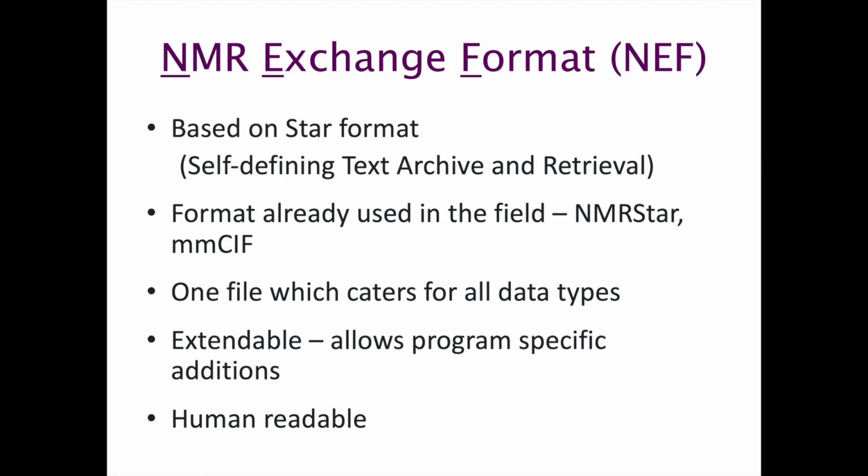So the NMR exchange format is based on the STAR format, the so-called self-defining text archive and retrieval format. You're very possibly already familiar with it from NMR-STAR files, and mmCIF files also use the STAR format. The nice thing is that within one single file you can cater for lots of different data types. It's also extendable, which means that different programs can add additional bits of data to it without breaking it for other programs. And finally, what's quite useful is that it's quite easily human readable, in contrast, for instance, to XML, which is a bit awkward for us to read.